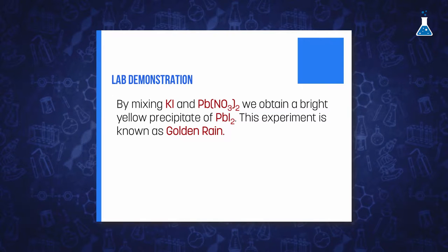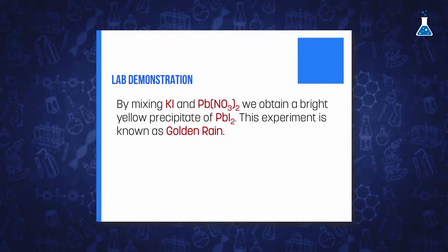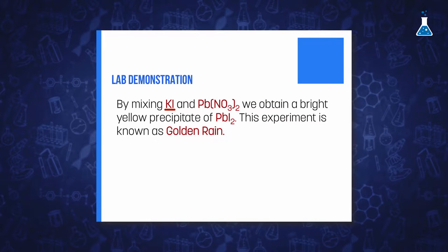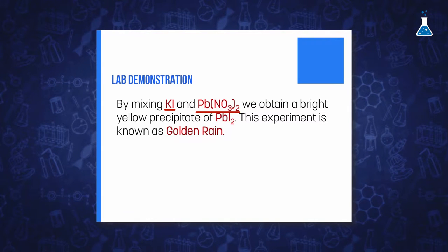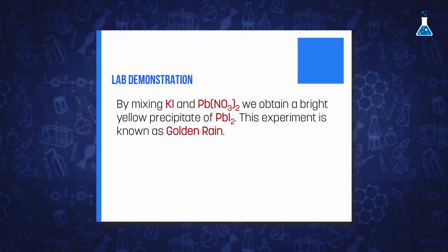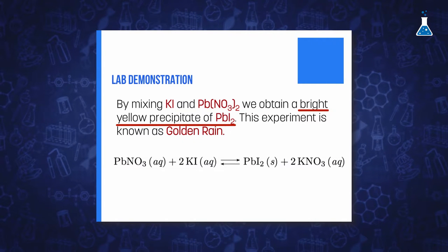In the following demonstration, we are going to observe the limited solubility of a lead salt in water, specifically lead iodide, through an experiment commonly known as the golden rain. This demonstration is a very common experiment in chemistry classes, which consists of mixing a potassium iodide solution and a lead nitrate solution, which react through a double displacement reaction to give a bright yellow precipitate of lead iodide, according to the following equation.